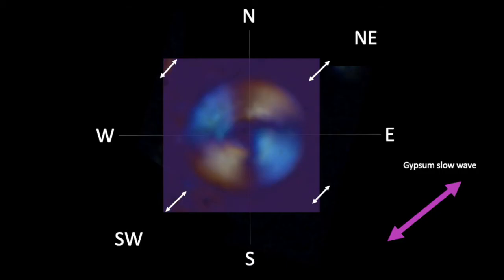Right, yellow means that retardation decreased, retardations subtracted. So, the rays of calcite that are aligned with the slow gypsum ray are of opposite nature. So it's the faster extraordinary ray of calcite that is vibrating in the northeast-southwest direction.